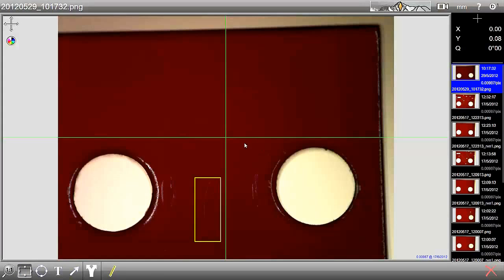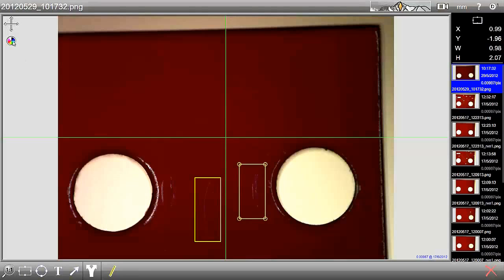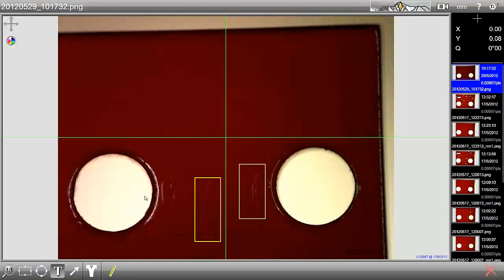I'm just going to do the same thing over here on a second area of damage. We need to add a little text so we can actually see what the problem is.